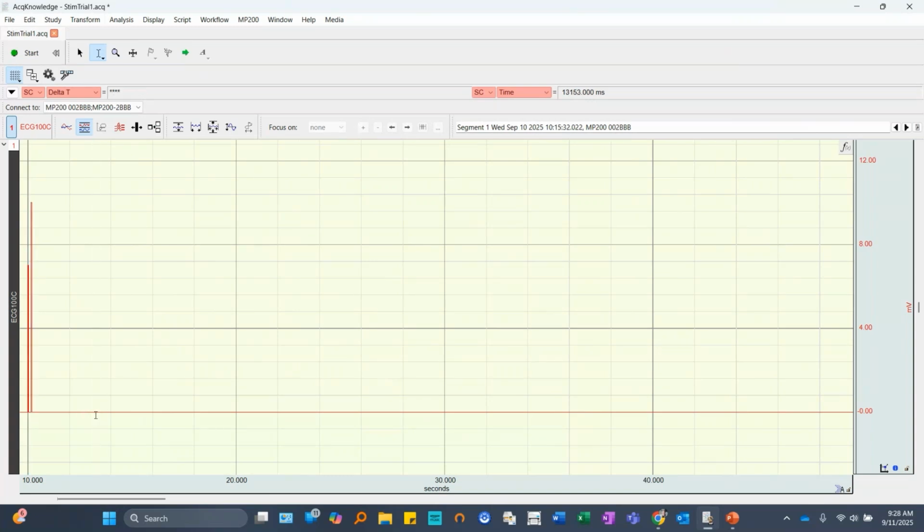So I want to place these, and again, this is going to be up to you to define. But generally, according to literature, you want an inter-trial interval of somewhere between 15 and 30 seconds throughout the entire trial. So basically what we would do, if we know this one started at 10, if we want to jump ahead somewhere around 15 seconds, we're going to be looking somewhere in the 25-second neighborhood, and that's where this time comes in here.